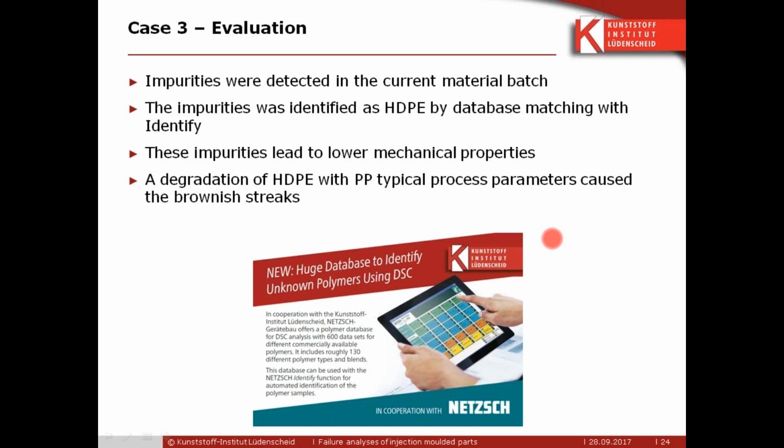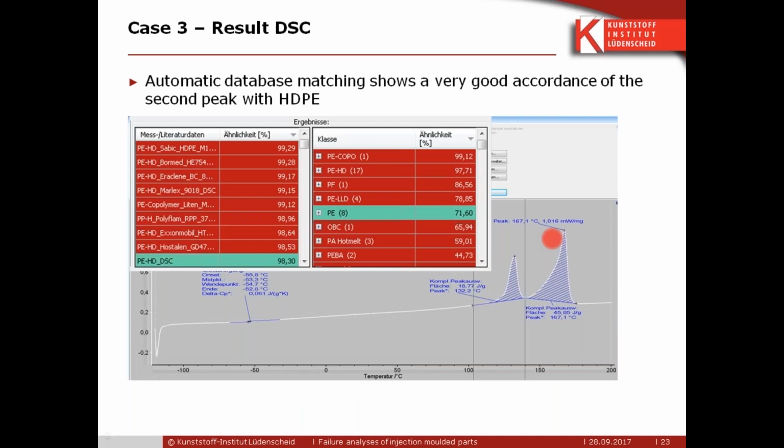You have to cut the edges of the sawing away and not analyze them. The more gentle you do your sample preparation, the better it would obviously be for your analysis, because you don't want to change the sample by preparation, but most mistakes are made in the sample preparation. Yeah, I know that from my own experience.